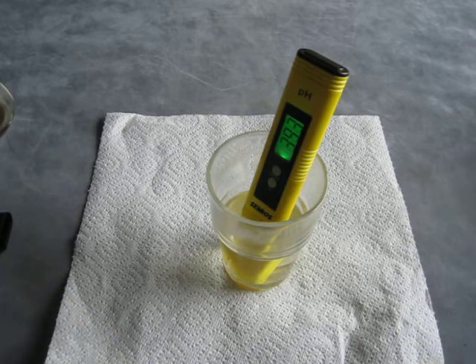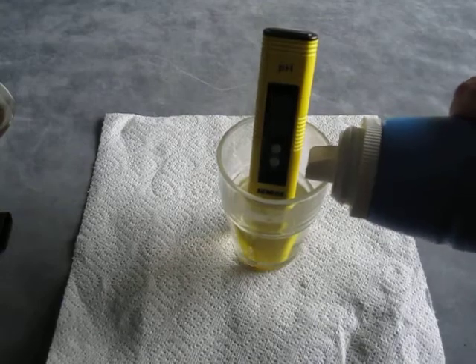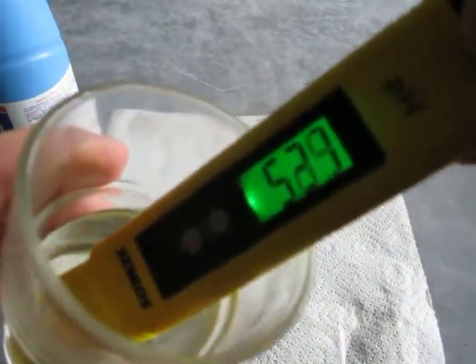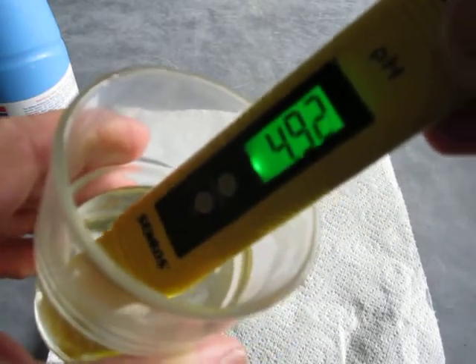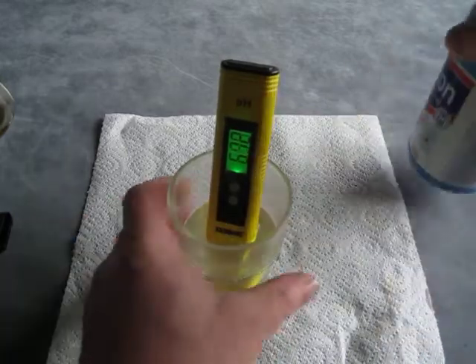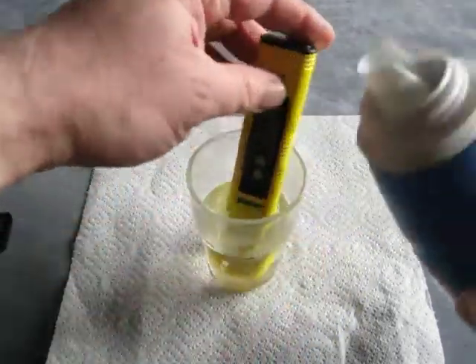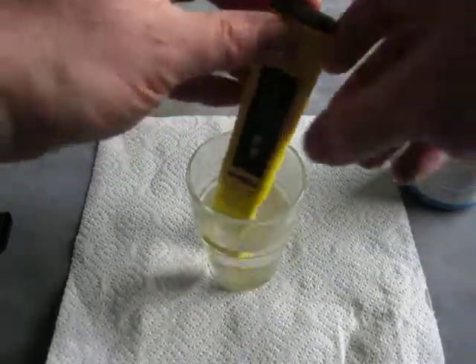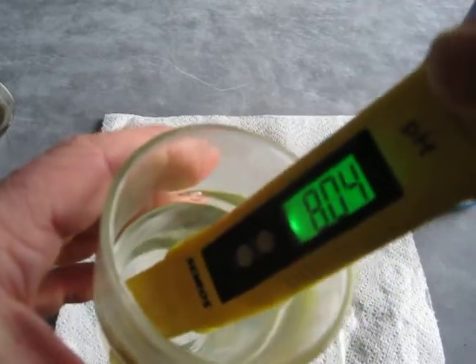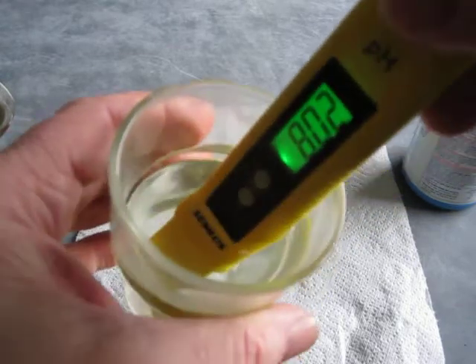What I've also got here is a Milton Fluid, and Milton Fluid is a pretty strong alkali. So I only need to put a bit in here. You can see we've already gone back up from that 4 to near a 5. And if we pour some more in — back up to 7.5. And if we go further, now we're up to 8. You can see how the display constantly changes, giving you an accurate reading.